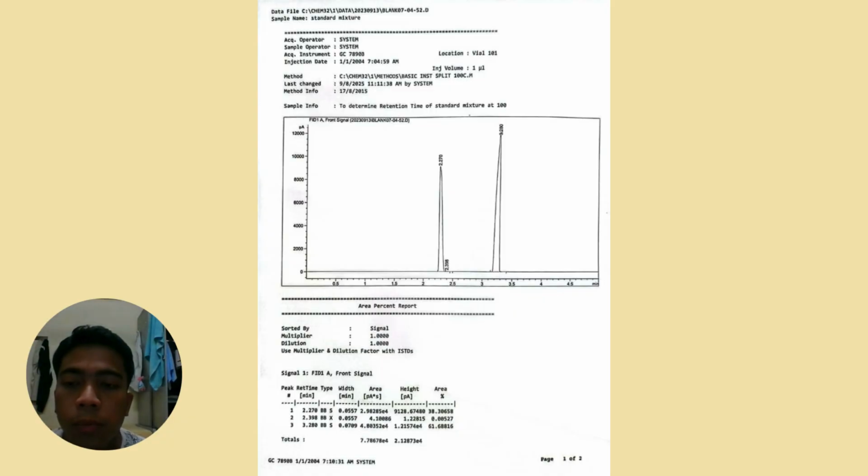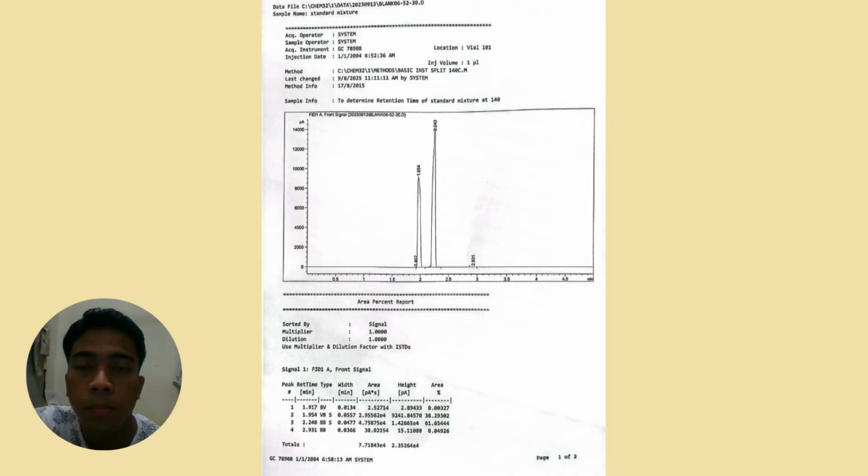And the second highest peak recorded has a retention time of 2.270 minutes, while the percentage area is 38.30%, and the height of it is 9,128.67. And the last sample is the sample mixture at 140 degrees.